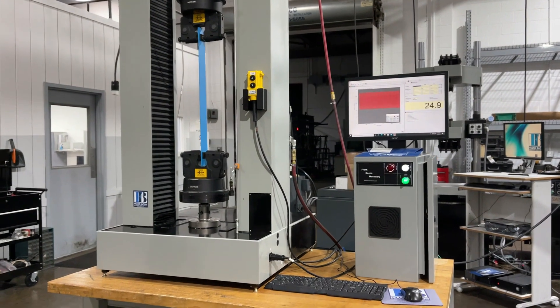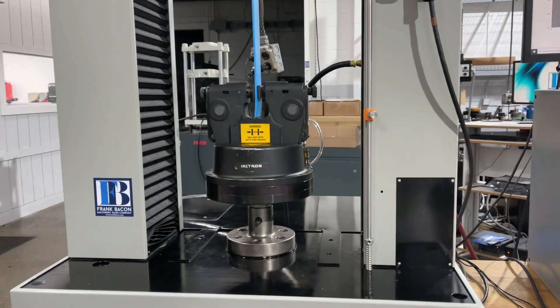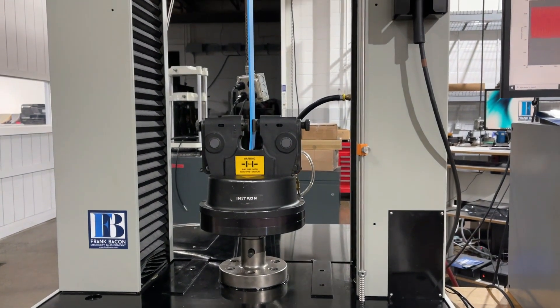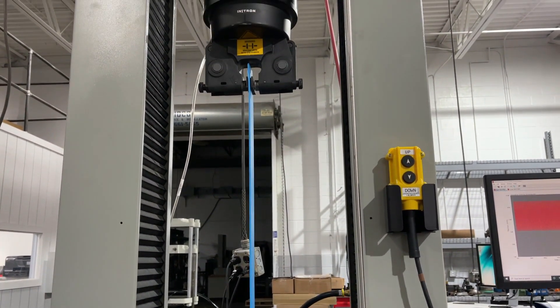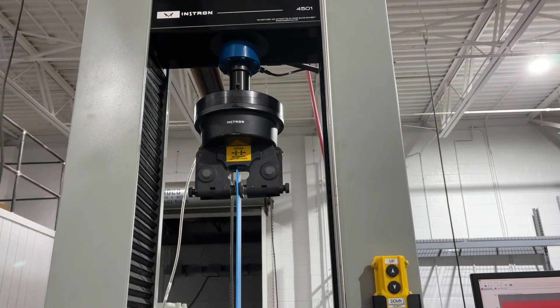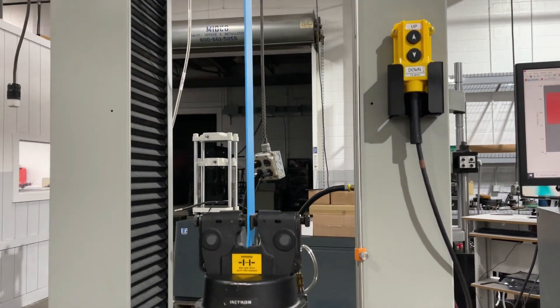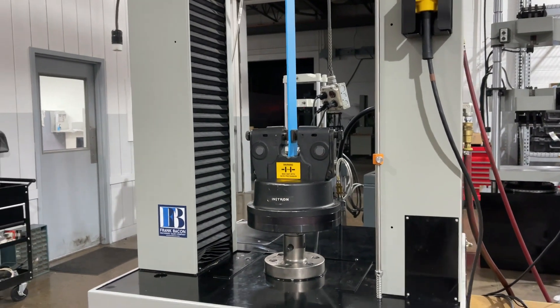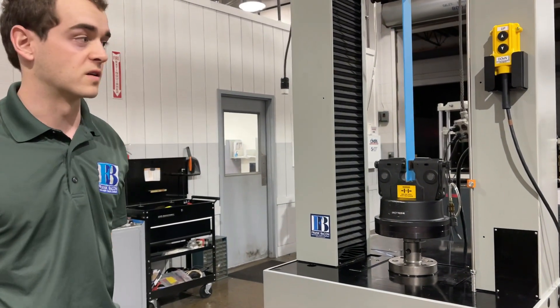Over time for 500 cycles, we figured that the regular side-action vise grips — just mechanical grips — would probably end up slipping a little bit and losing their bite on that sample. So we wanted to go with nice Instron pneumatics to keep a good grip on that sample over 500 cycles.